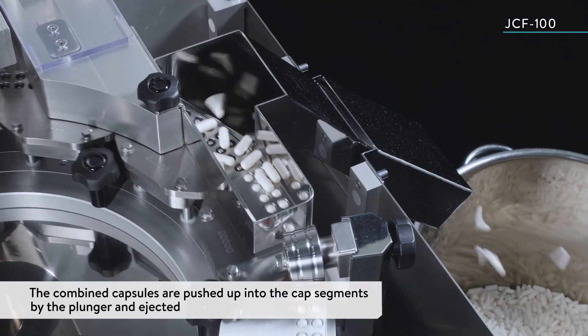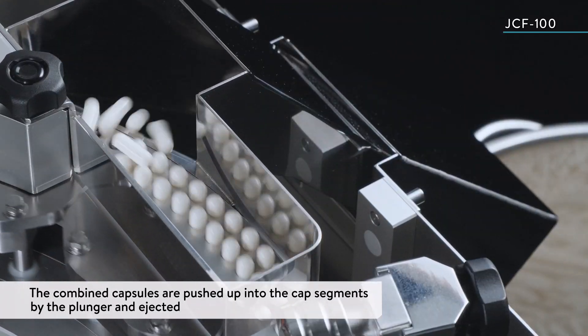The combined capsules are pushed up into the cap segments by the plunger and ejected.